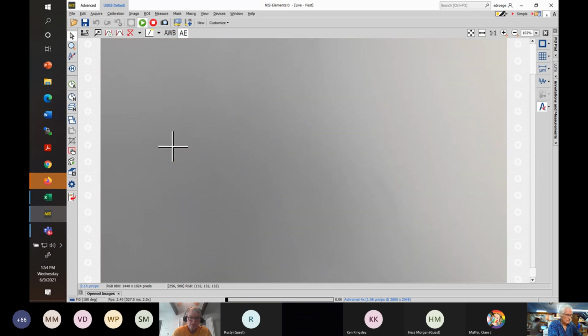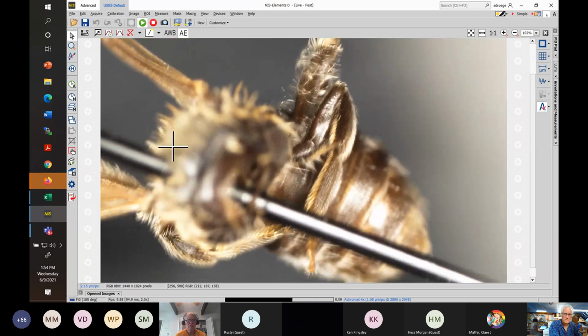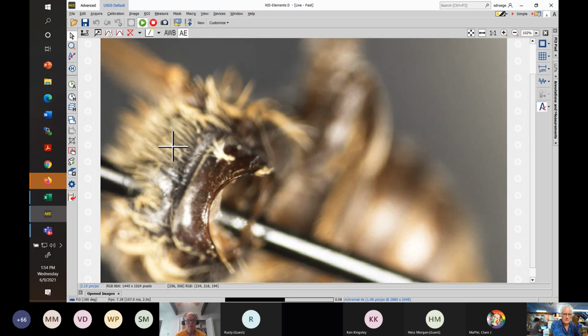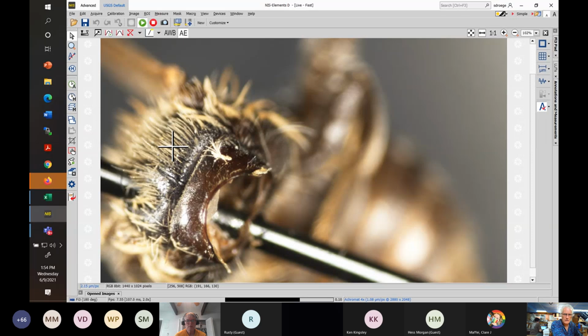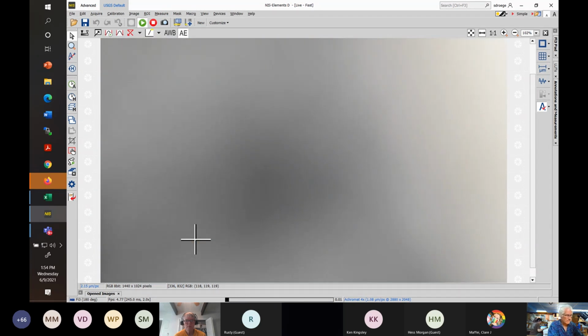We'll do one more view straight on. Okay, so the head area is gone, and you see this whole thing is all smooth, no corners here and here. This is the scutellum up here, and the head is gone, but this is the pronotum at that point. We can do a quick look on this specimen. Nope, I think we're good.